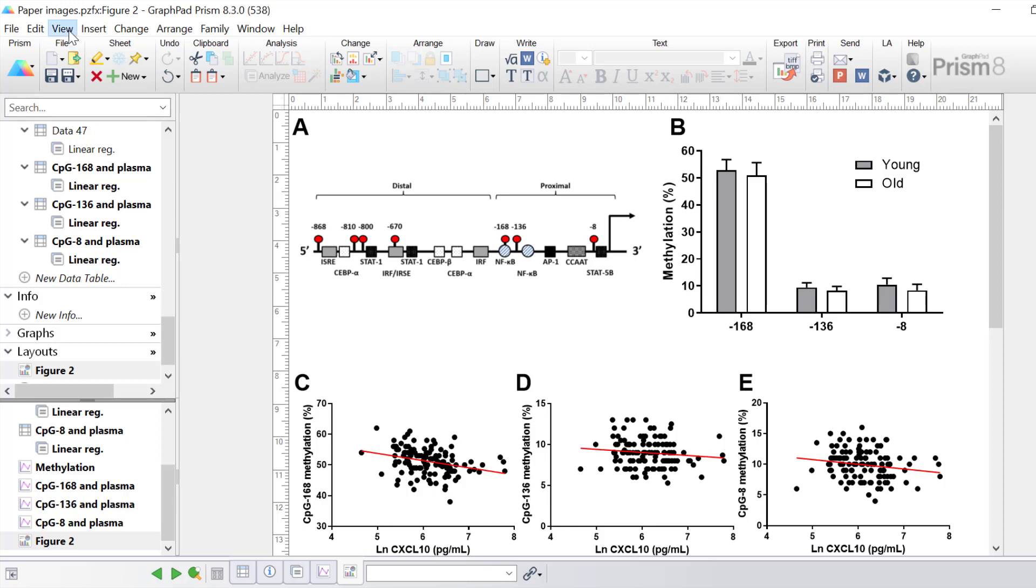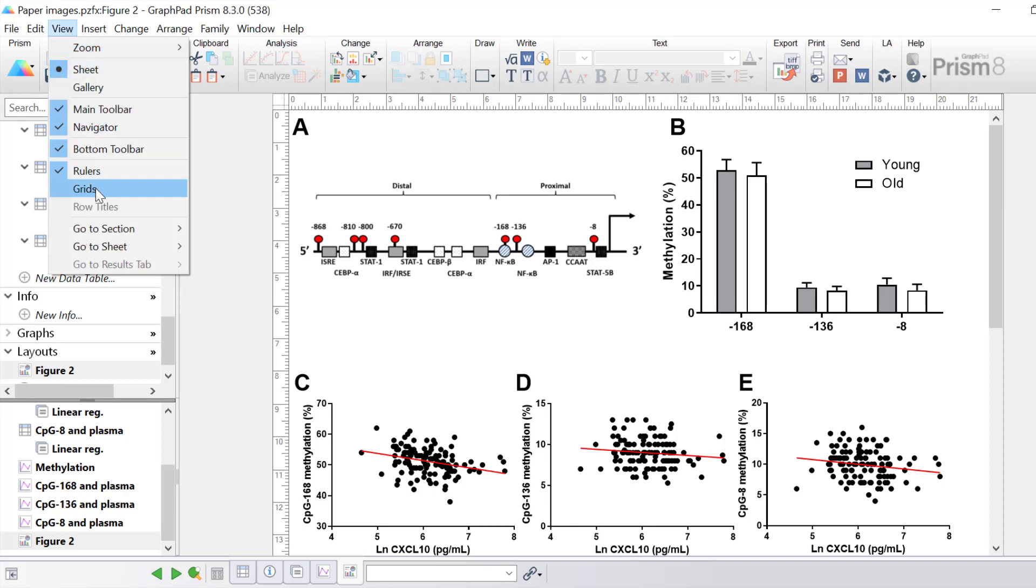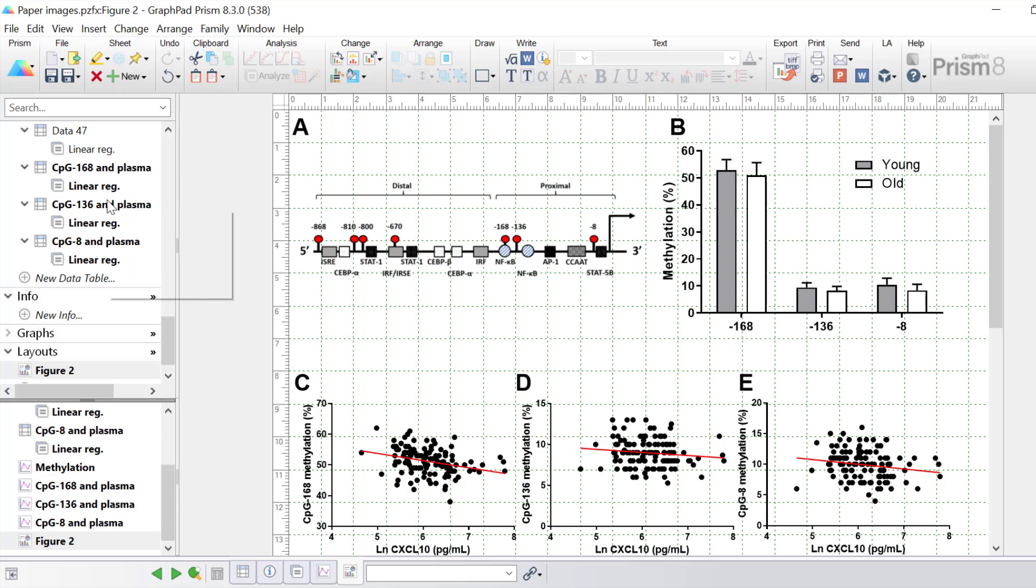If we want to view the grids we go to view grids and notice there's dotted grids in the background of the image. These can be very useful when you want to space the images out equally on the page. Notice that these grid lines and these rulers will not be present when you export the image. It's purely just for your reference.